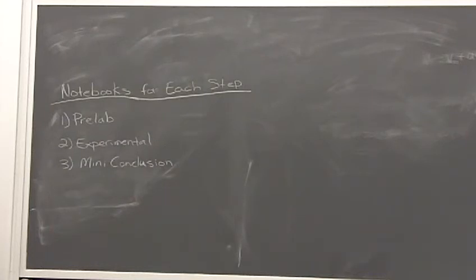If like specific questions like that, I just clarify with your own lab prof just to make sure. But for my students, a general summary of the NMR and the IR is good enough. Touch on the high points. Like if you made the methyl ester, you know, are all those peaks present in the NMR? That's that sort of thing. Does the IR look like it should and match what the product should look like?